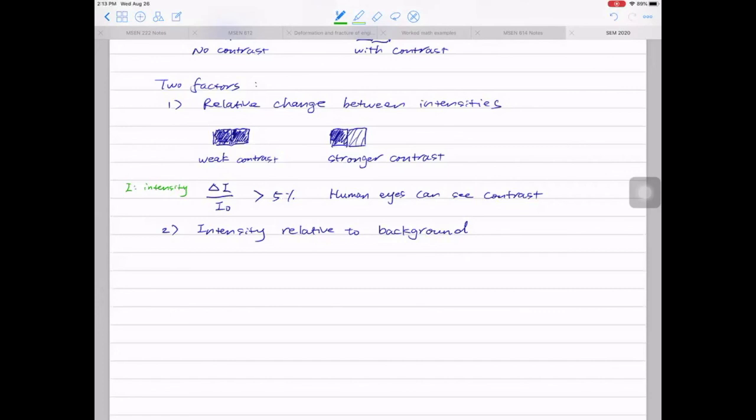That's a really good question. Assume it's a grayscale picture. So it will be from 0 to 255, from super bright to super dark. Then in between, you'll see the numbers. That's how you can quantify the intensity. Does this kind of make sense? Yeah. Okay, cool. Another way, for example, in electron microscopy, another way to look at intensity is locally there are how many electrons.